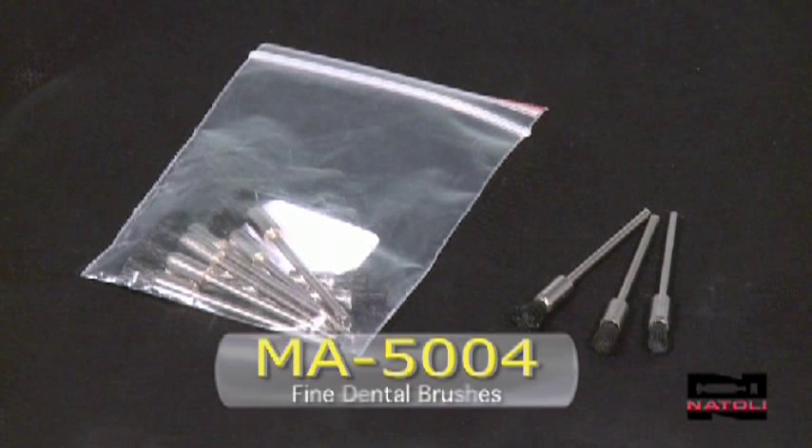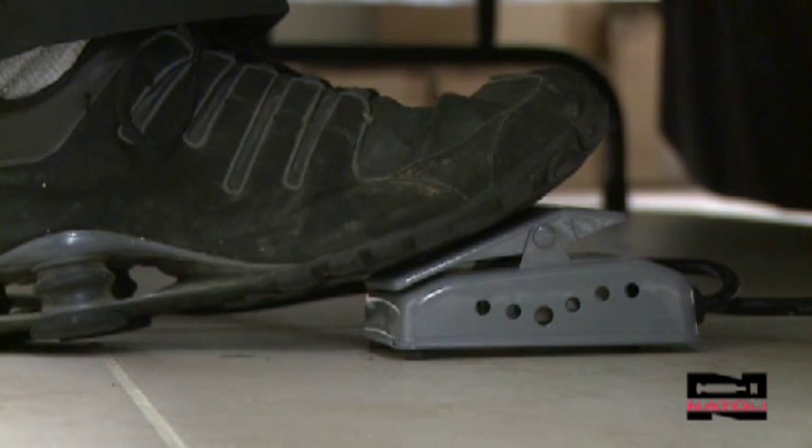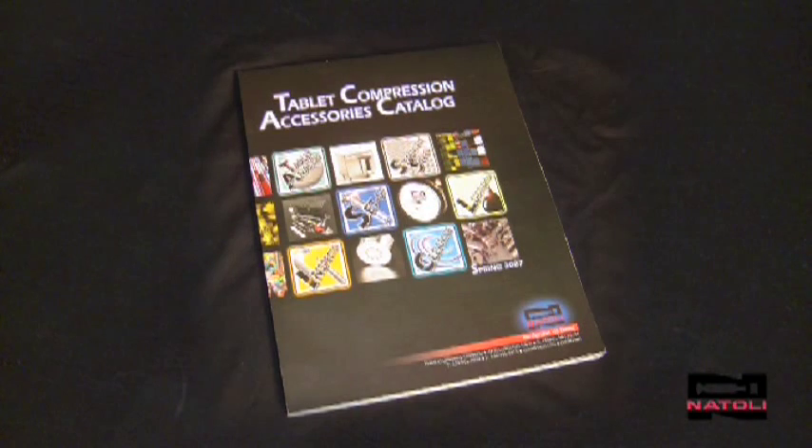The fine dental brush, part number MA5004, is ideal for light to medium punch cup polishing and is used with a hand polishing motor and foot speed control. Complete hand polishing kits are available in the Natoli Engineering catalog.